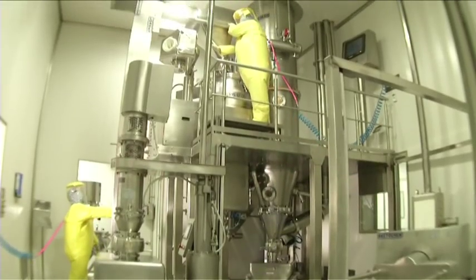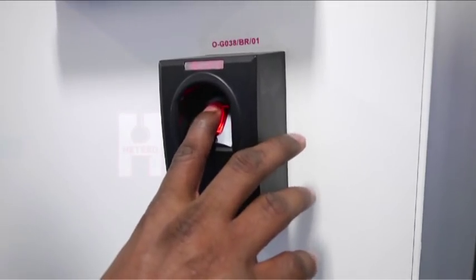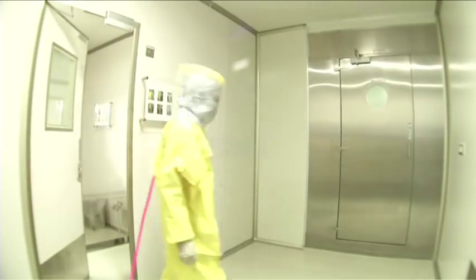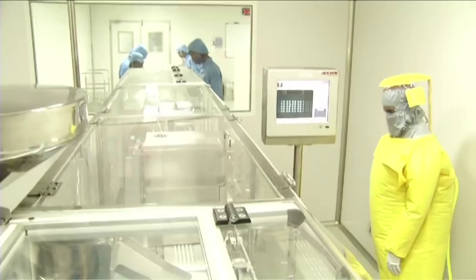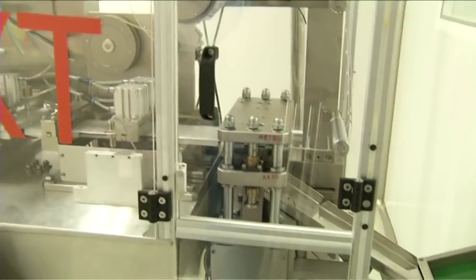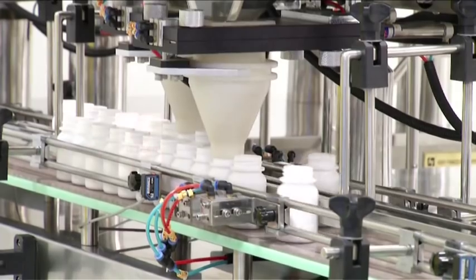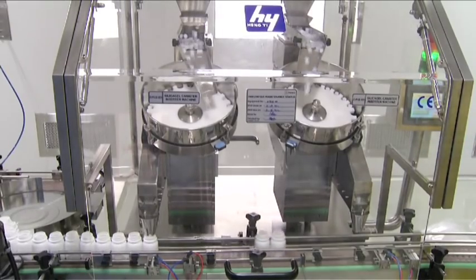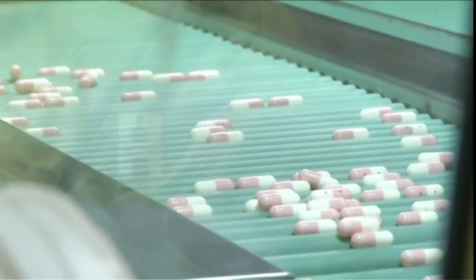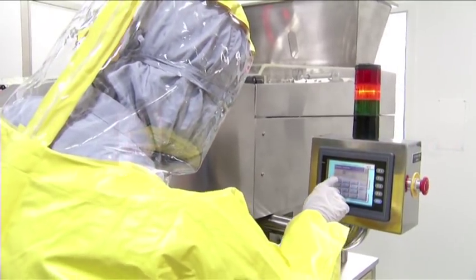The highest standards of containment processes are followed at Hetero. To begin with, access to the manufacturing areas is restricted. Biometric sensors ensure only authorized personnel enter these areas. The tablet and capsule manufacturing operations are carried out in Class 4 areas having advanced equipment for API containment and insulation. This ensures occupational exposure level of not more than 1 to 10 micrograms per cubic meter in 8 hours.